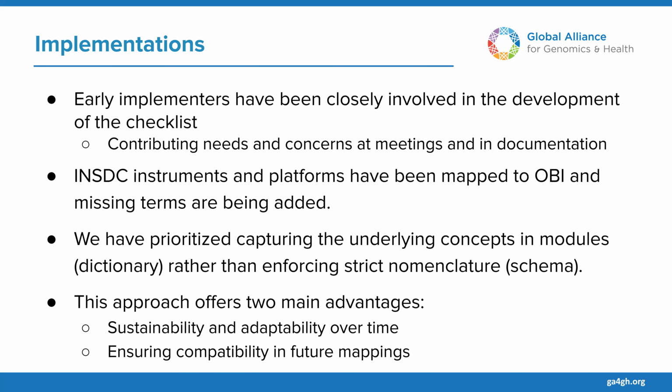So really looking at all the data that's been submitted up to now in the resources such as the ENA, and trying to fill the gap with the ontology, so that it would be able to be used to properly fill sequencing platform using an ontology term.